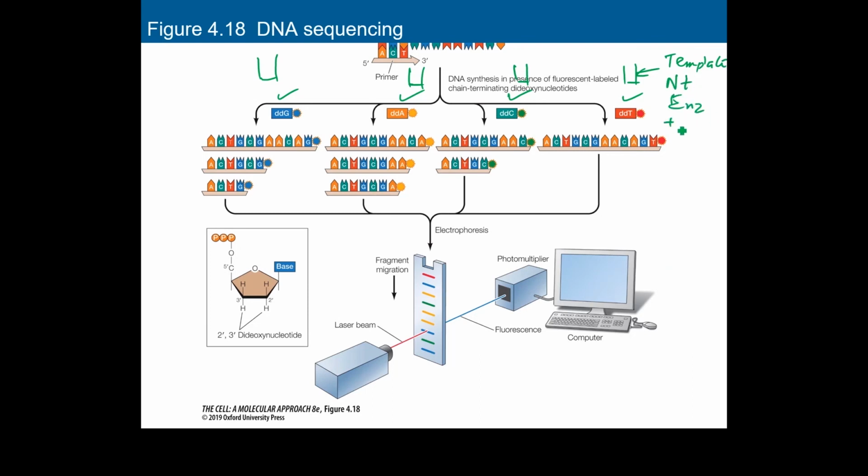Then one additional component, unique to each tube, will be a dideoxy. Other than the normal nucleotides, he will add only one type of dideoxynucleotide.